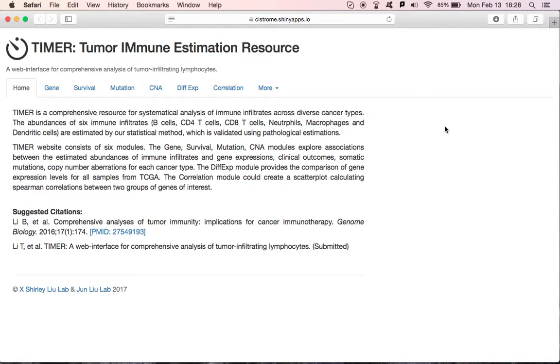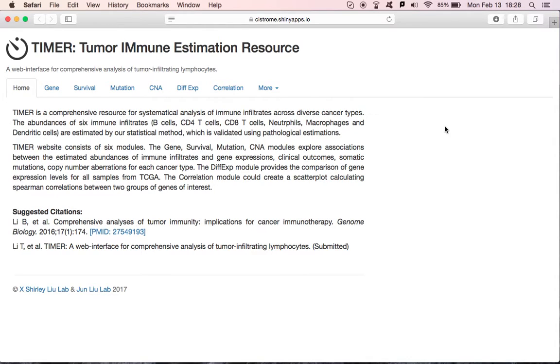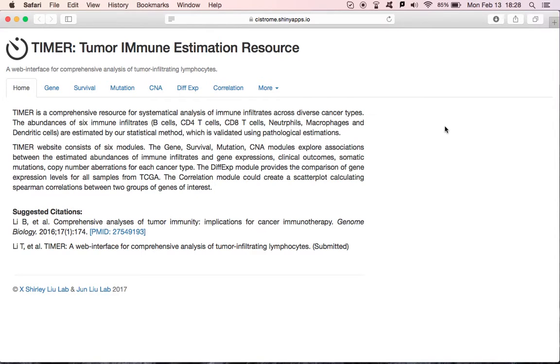TIMER is a comprehensive computational tool to explore and visualize the interactions between tumor-infiltrating lymphocytes and important biological signatures. Previously, we developed a deconvolution method to estimate the abundance of six tumor-infiltrating lymphocytes from TCGA gene expression profiles. To explore the associations of immune cells with multiple genomics data, we built this web interface to perform genomic analysis dynamically. TIMER consists of six functional modules shown in each tab panel. Let's get started with the gene module.